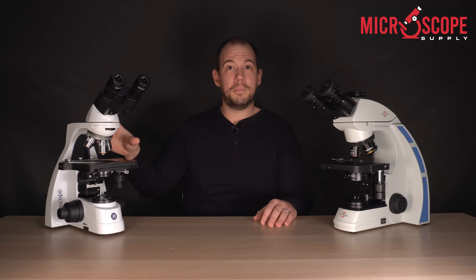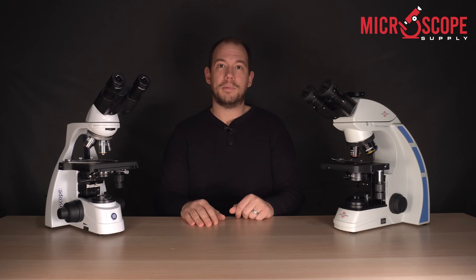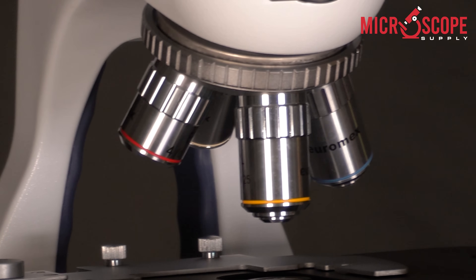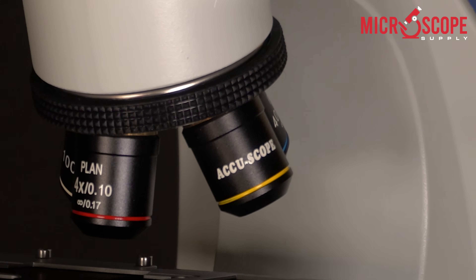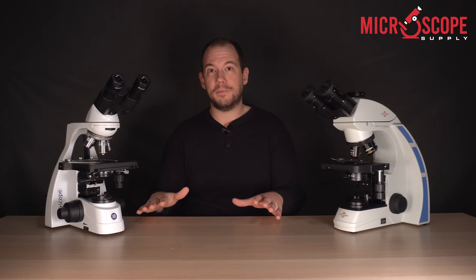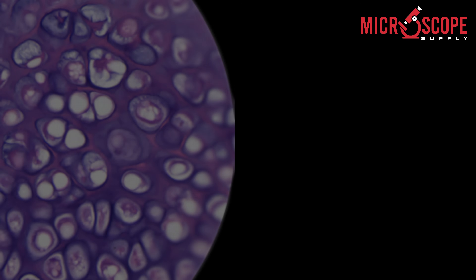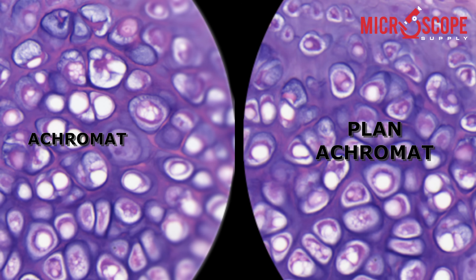Here I have the Euromax B-scope and on this side the Accuscope 3000 LED. Both microscopes have options for achromat and plan achromat objectives, but the B-scope currently has achromats and the 3000 LED has plan achromats. Achromat objectives are less expensive and have image flatness across about 80% of the field of view, with a slight drop-off on the outer 20%. Plan achromat objectives are a little more expensive but have flatness across the entire field of view.